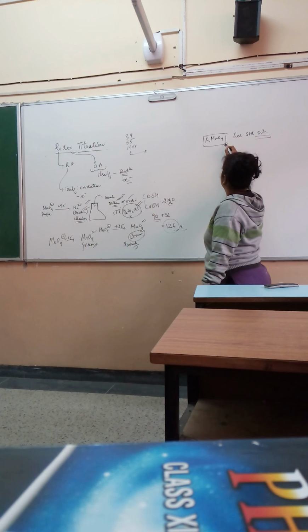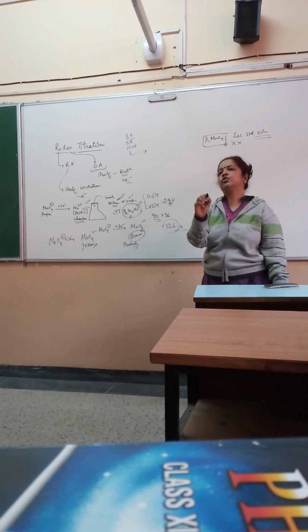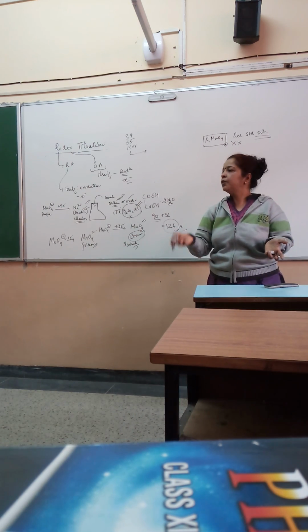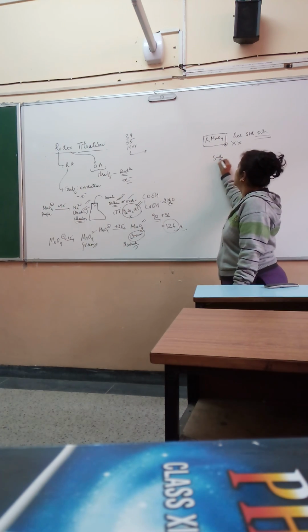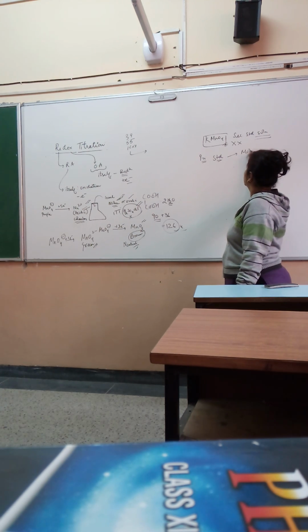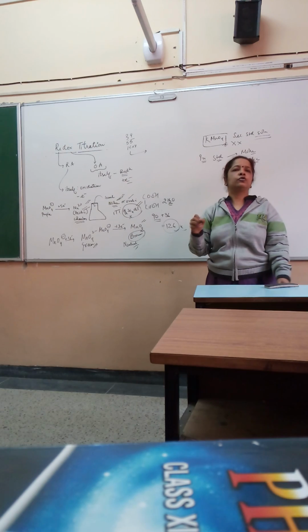To avoid that, we never make this as a solution. Your teacher will never ask you to make a KMnO4 solution because you cannot prepare it to perfection. It would keep changing the concentration. So your primary standard solutions are either Mohr salt or oxalic acid. Any of the two can be asked to prepare.